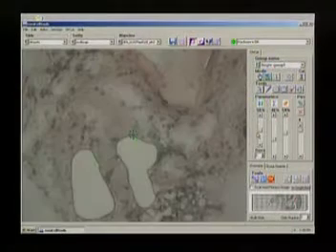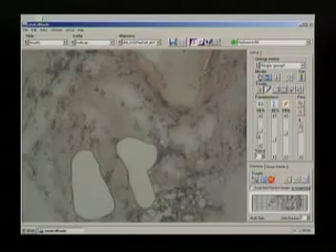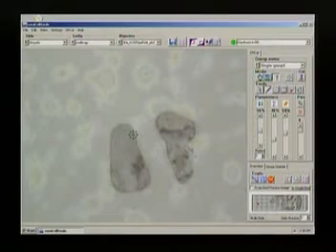The cutting and removal of the sample are particularly gentle processes, which occur while still maintaining the integrity of the selected specimen, without any additional heat or radiation influences.